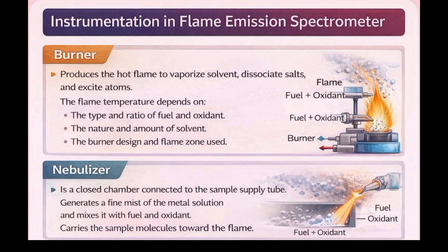Nebulizer. The nebulizer is a closed chamber connected with the sample through a tube. It also has a continuous supply of fuel and oxidants for the smooth flow of the flame. The nebulizer also contains inert gas which acts as a carrier of the sample molecules toward the flame.